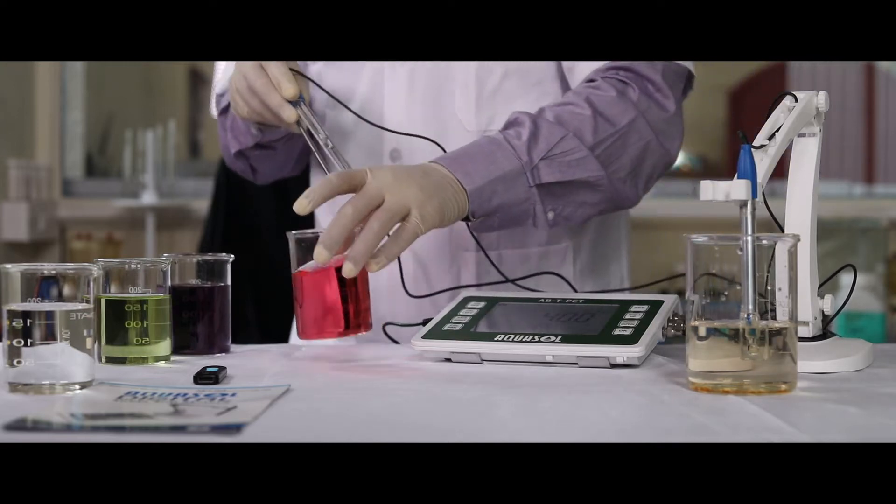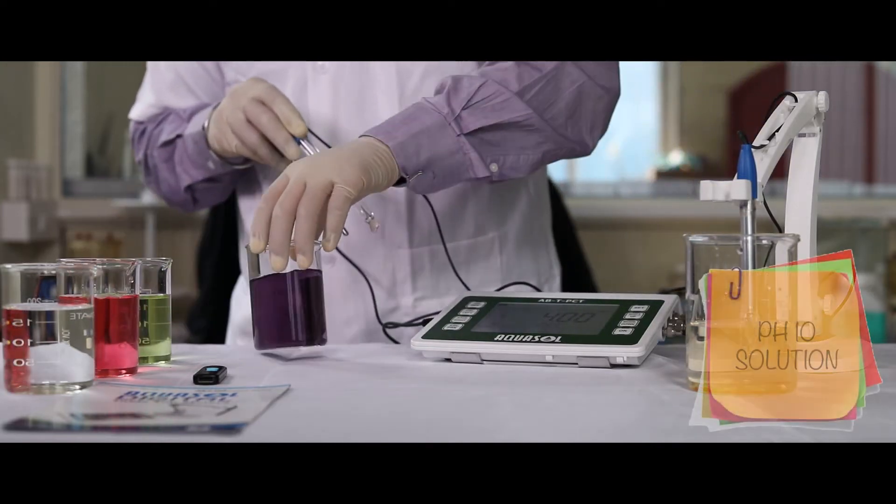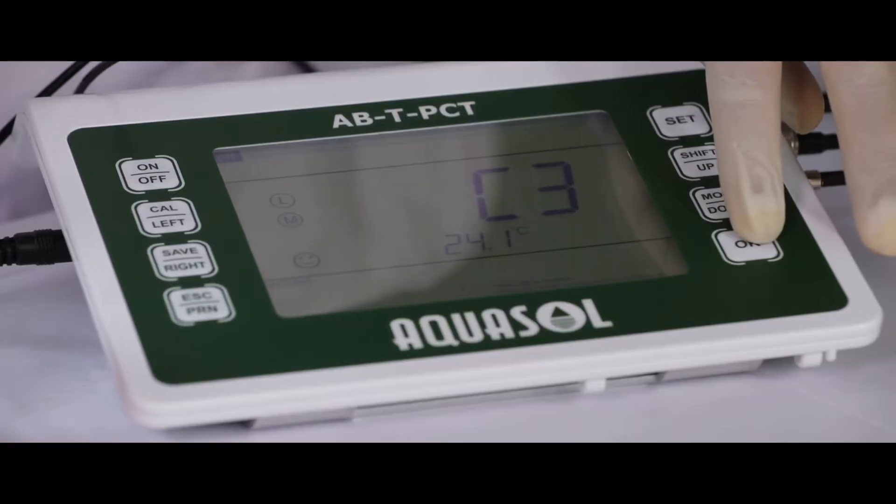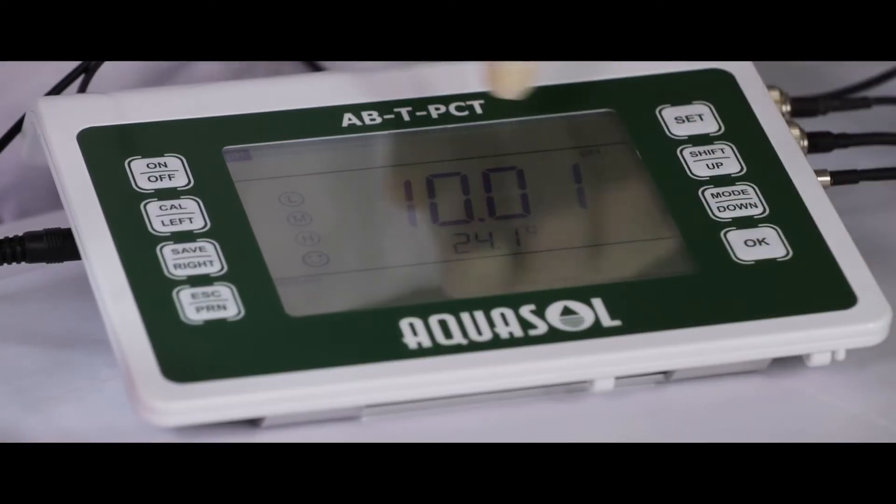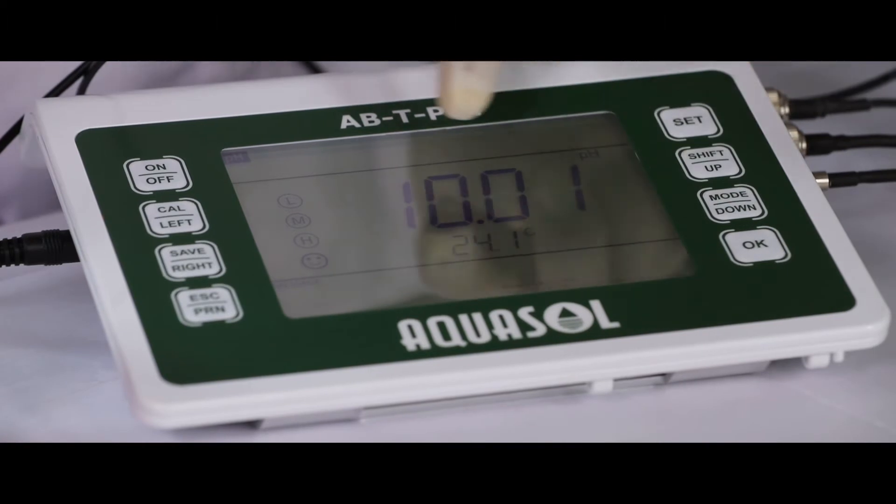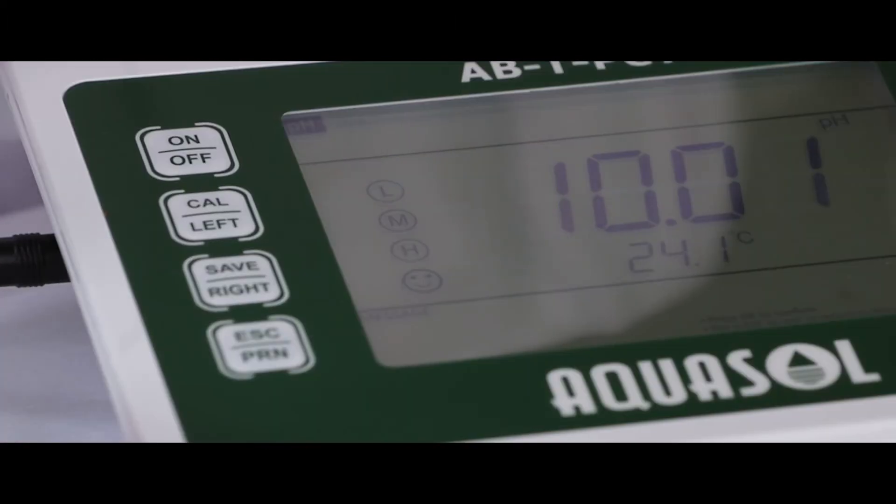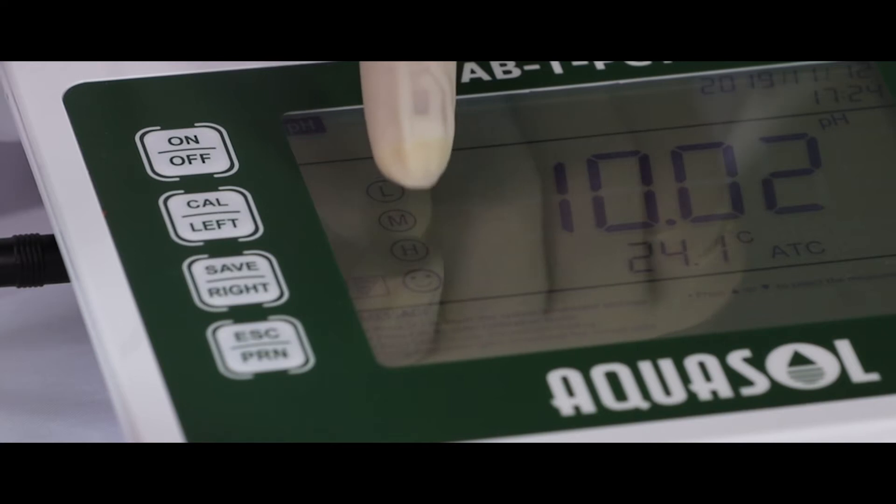Repeat the process for C3 with pH 10 solution. If all your calibrations done right, then the meter will display L, M, H.